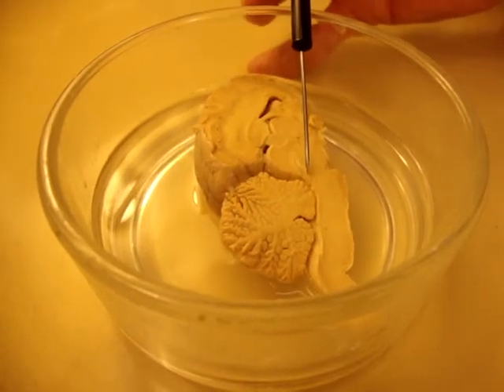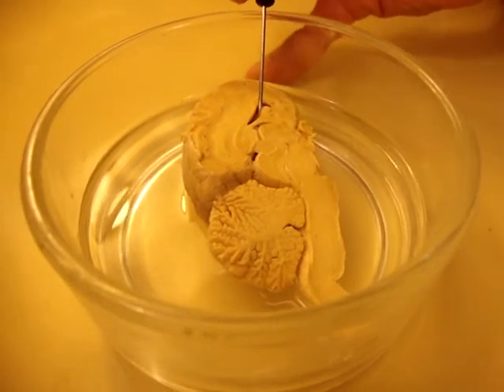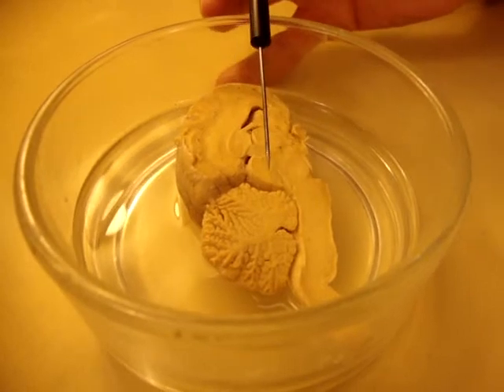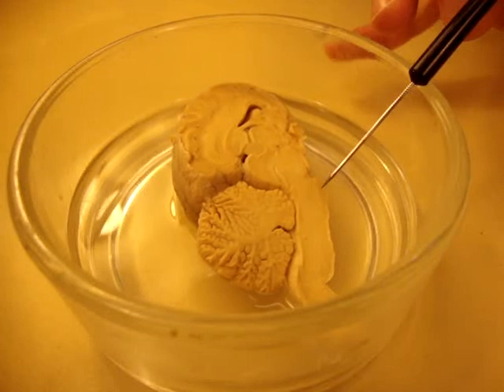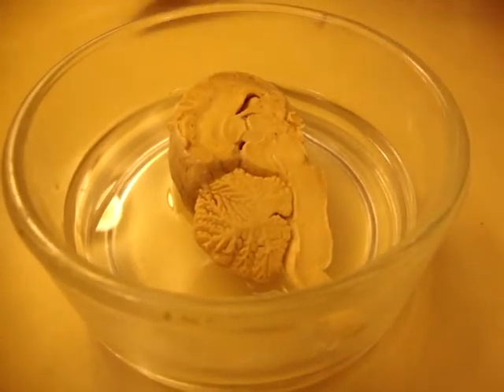It presumably is a channel that would connect the third and fourth ventricles. So we just got a little sliver of it here. And then this little bit down here, see this little outcropping? That's your pons. So that's the relay center of the brain. It takes everything from here and sends it up there.